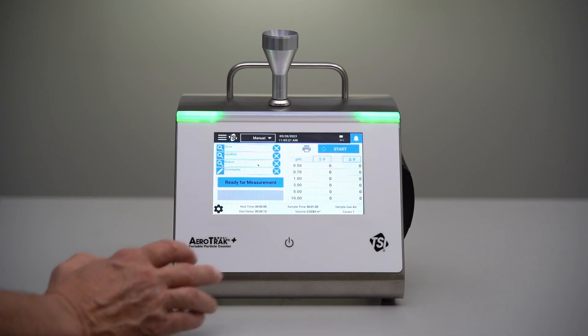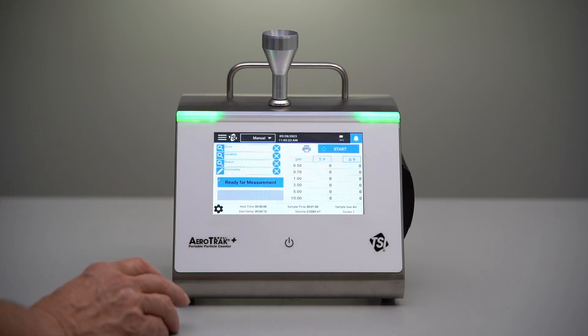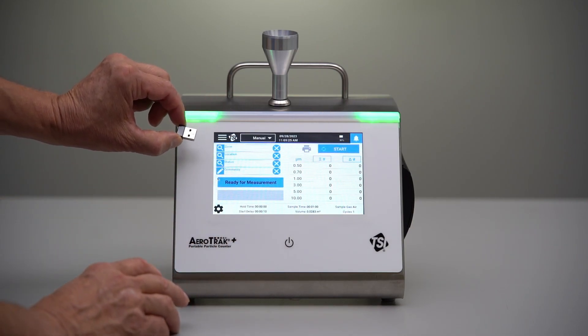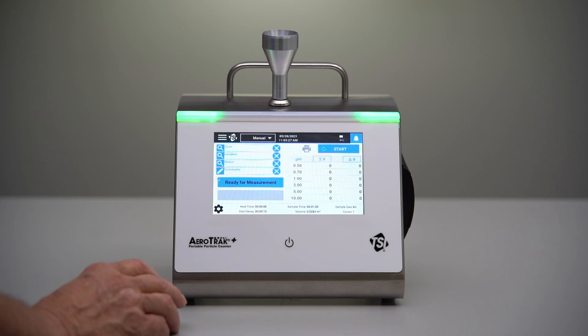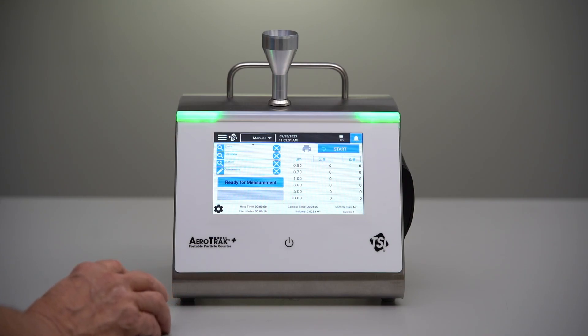Today I'm going to be using a mouse just to keep my hand from blocking the screen. We actually have a Wi-Fi feature on this instrument, so I can just take an off-the-shelf mouse and use it for Wi-Fi communications if I want to.